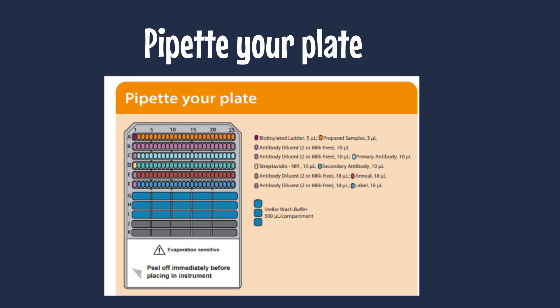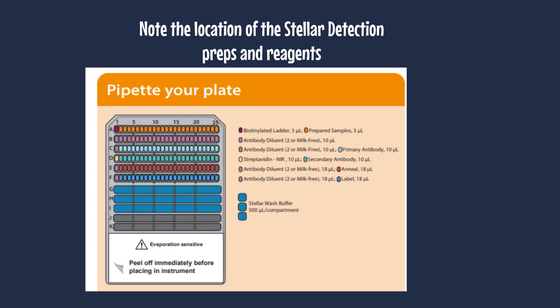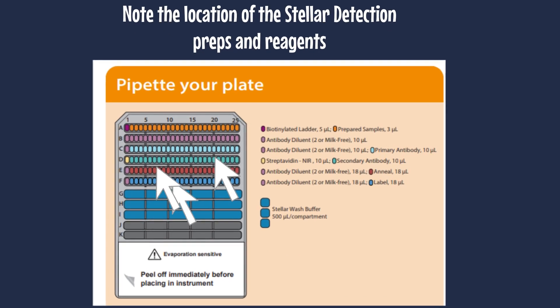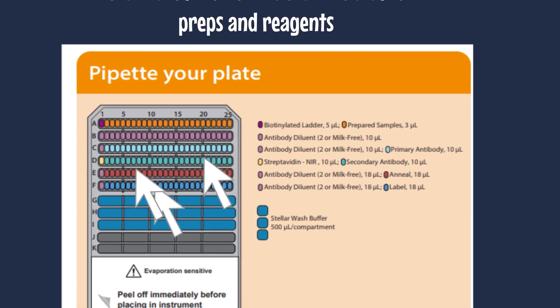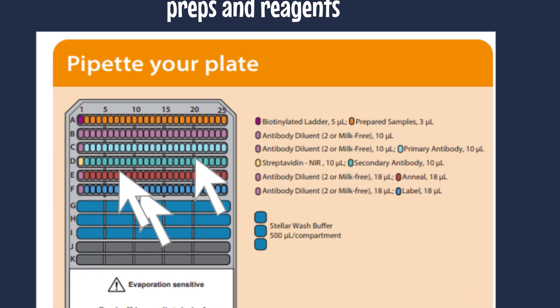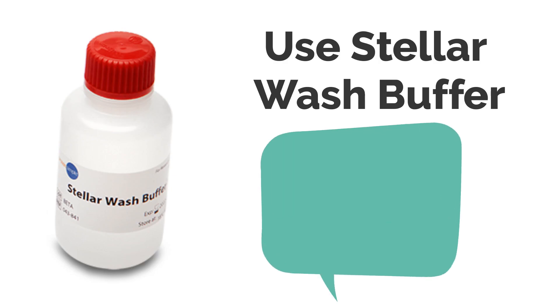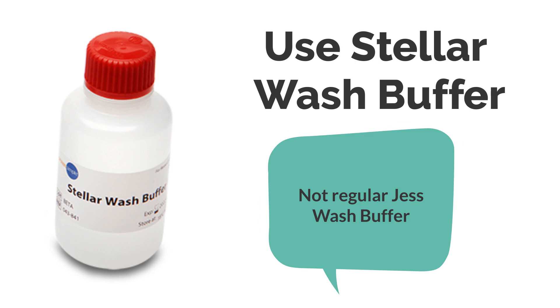Pipette your plate. Note the location of Stellar Detection preps and reagents. Use Stellar Wash Buffer — not regular JESS Wash Buffer.